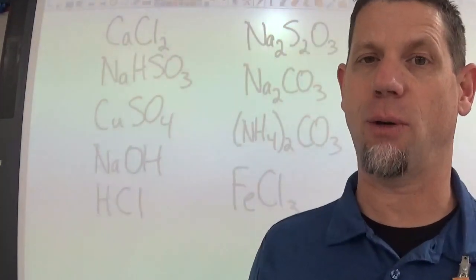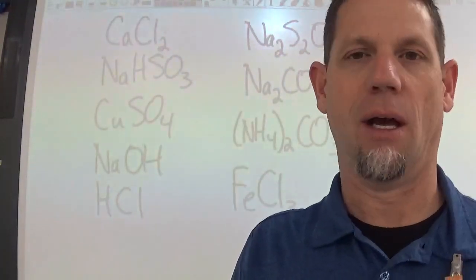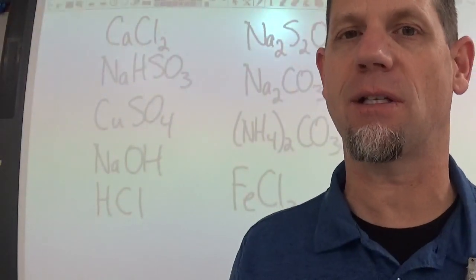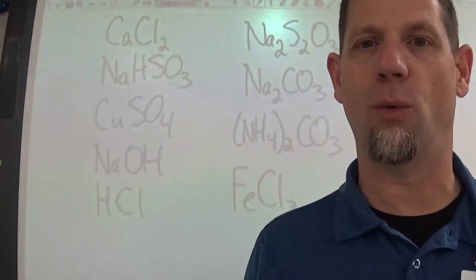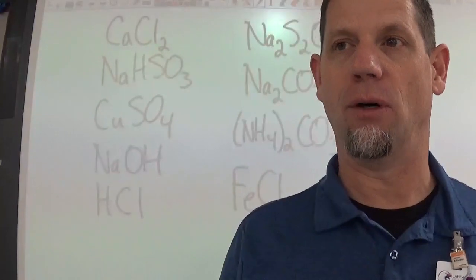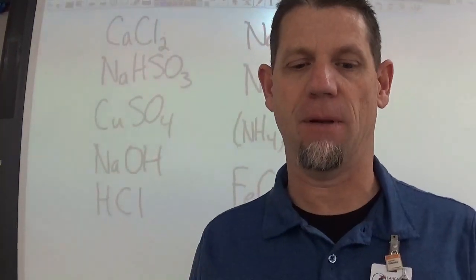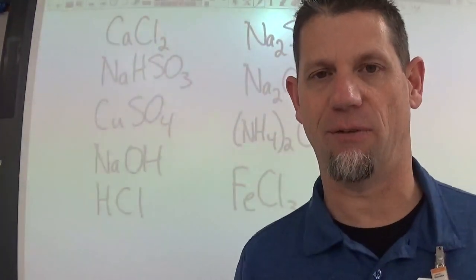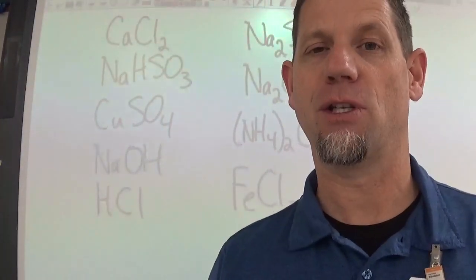So you're going to have to write a balanced equation, and you'll need to tell us what the driving force was of the reaction. Again, I will help you with the predicting of products, which you should be able to start figuring out based on the types of chemical equations that we've looked at. Again, I went really, really fast because I don't want to keep talking. I want you guys to figure some things out in the lab on your own. So I will give you a little bit of instructions in class if you need them, but for the most part, you'll have a spot plate, you'll have 9 different solutions, you get to decide which one's number 1, which one's number 2, and all that stuff, and then you get to mix them together, and you get to figure out which ones have reactions and which ones don't.